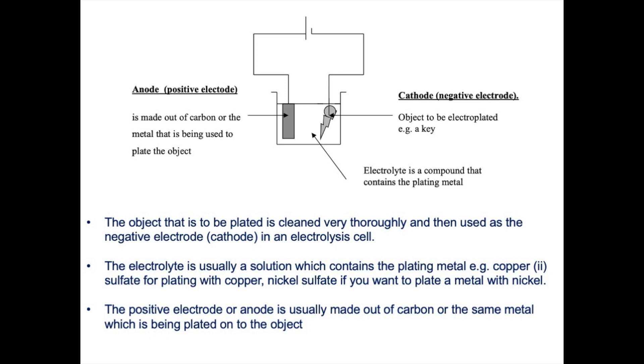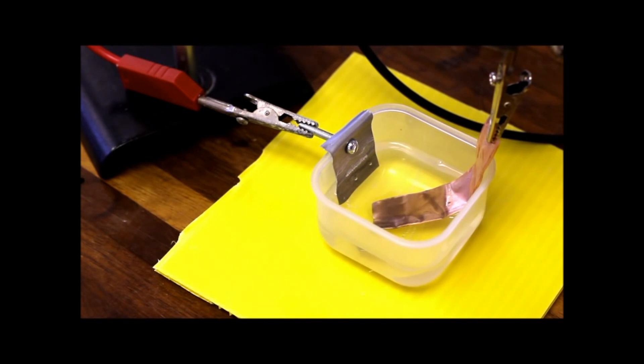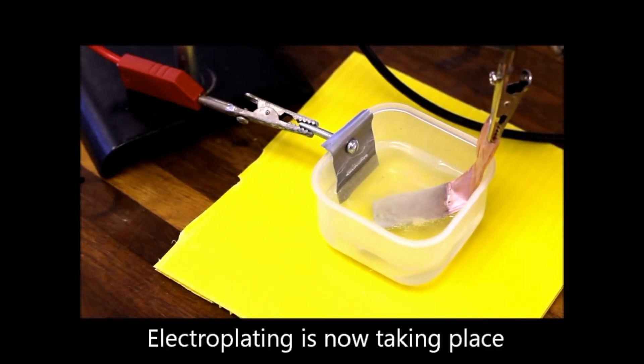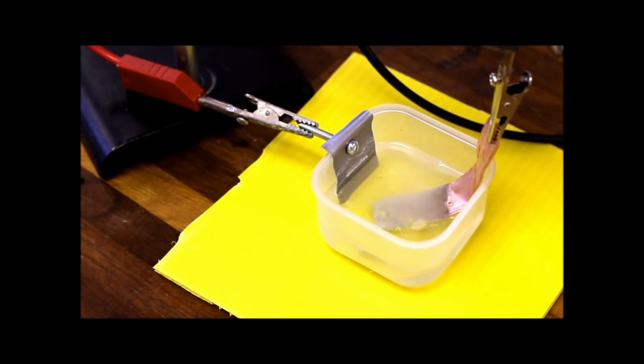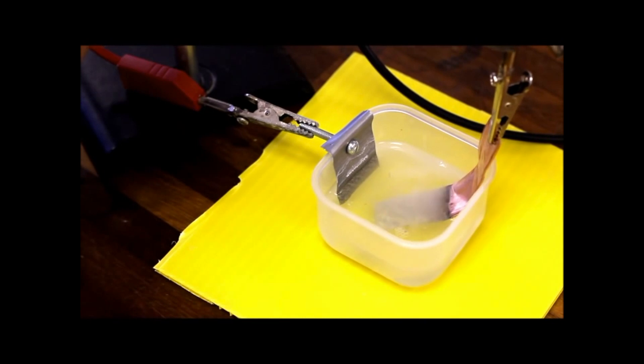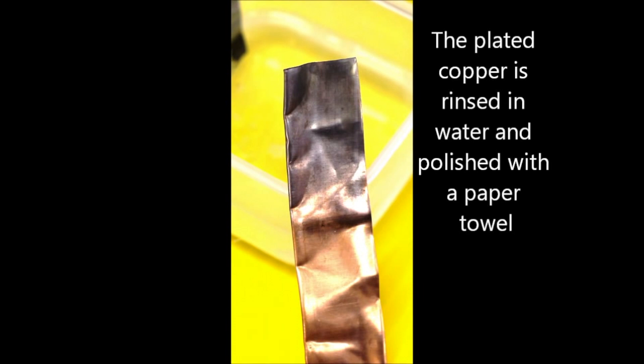This short video clip from CLEAPS shows an electroplating experiment in action. We have a piece of copper metal as the negative electrode, and this is going to be plated with zinc because we use zinc as the positive electrode. During this electroplating experiment the copper metal gets coated with a thin layer of grey zinc metal. The electrolyte here is a compound containing zinc, such as zinc sulphate. After the experiment we can see a thin layer of grey zinc coating the copper metal.